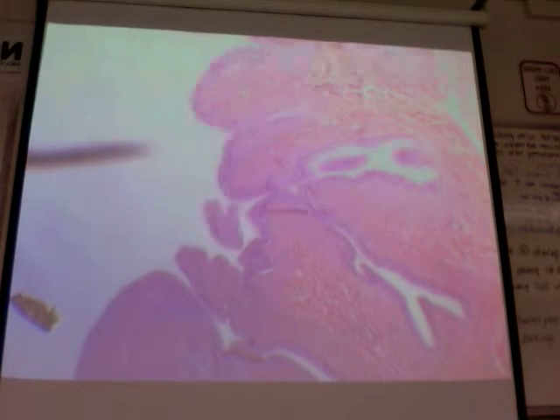This last one is the bladder. This is slide number 40. This is actually a new slide. I'm excited. Let's see what we got here. Oh, cool. All right, now this is a good one. This is low power, and this is the bladder. Remember the rugae, the ridges? So you can see how it's really folded. And as the bladder fills with urine, it stretches out. So this is going to be transitional epithelium. It's the dark pink stuff in there.